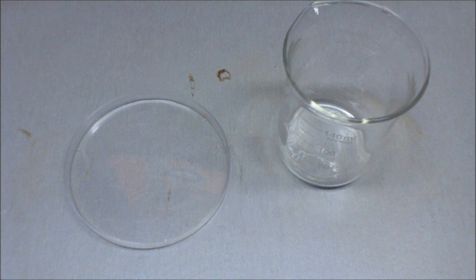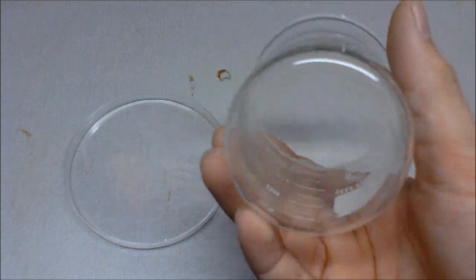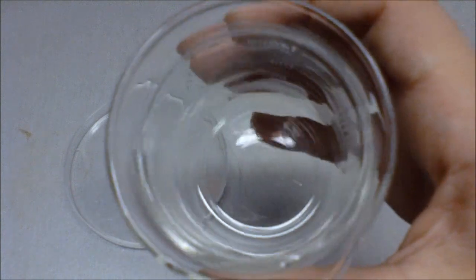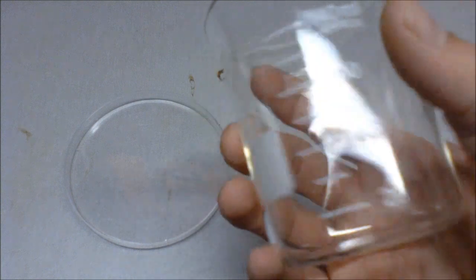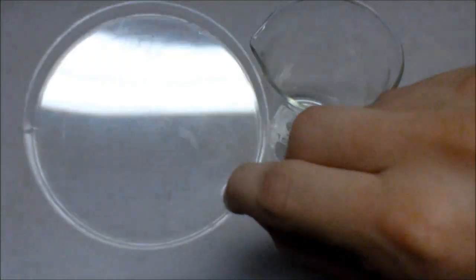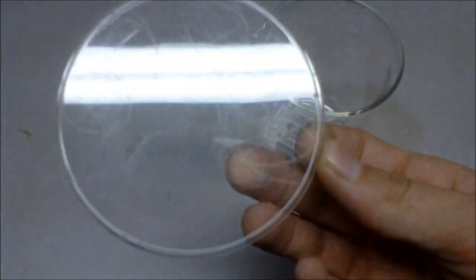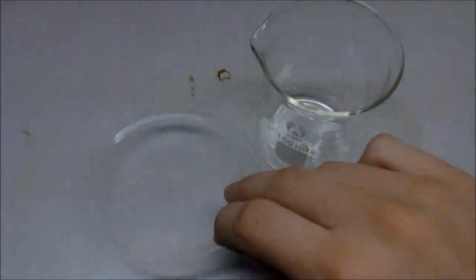These are both of the items after being thoroughly washed. Here is the beaker. You can see it is in near perfect condition with no evidence left of iron stains on it. And the petri dish is similar. You cannot see any rust stains or anything on it.